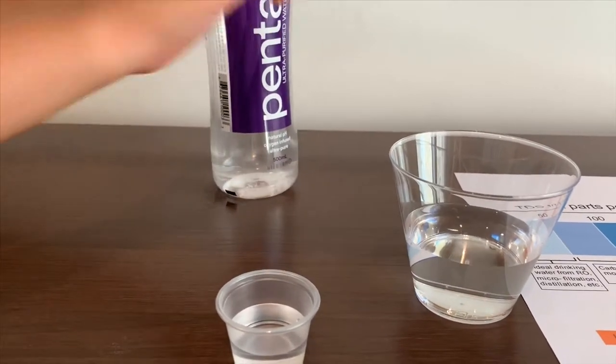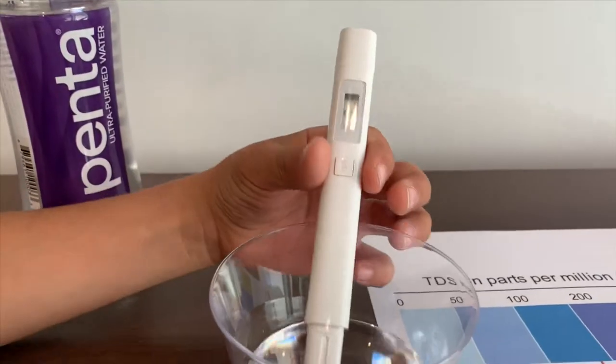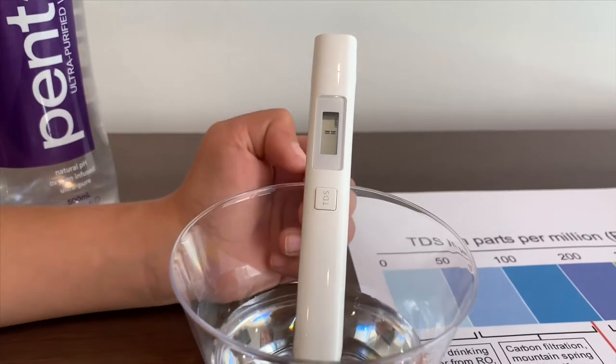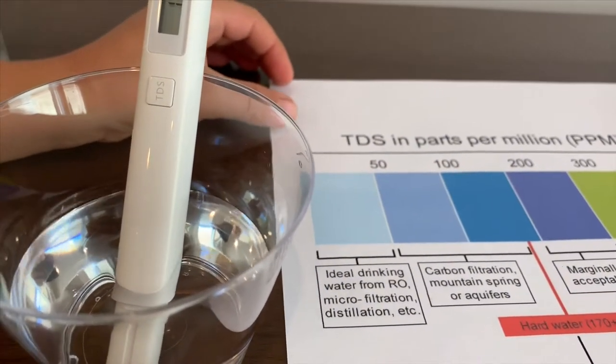Now let's turn on the TDS cluster, make sure it says zero, and let's put it in and wait. It is water, so it is ideal drinking water.